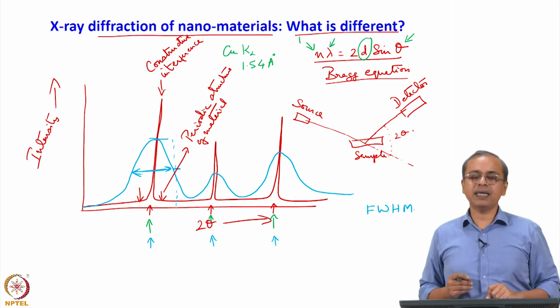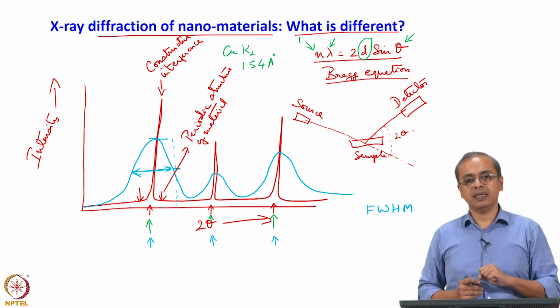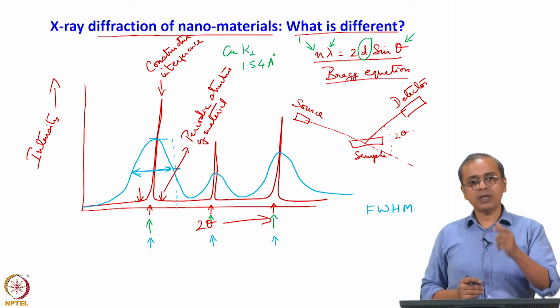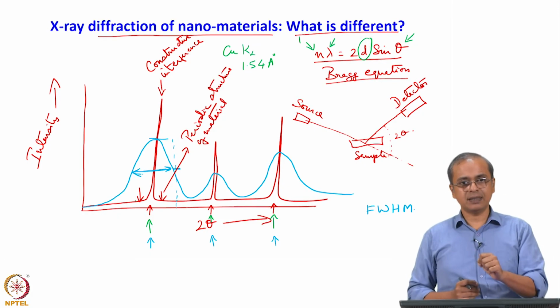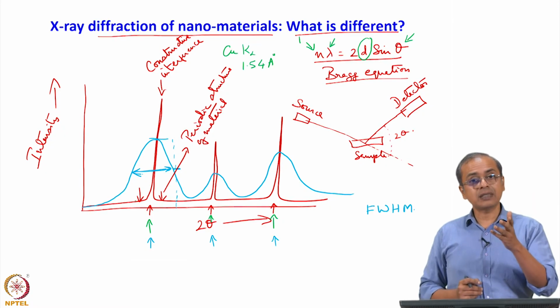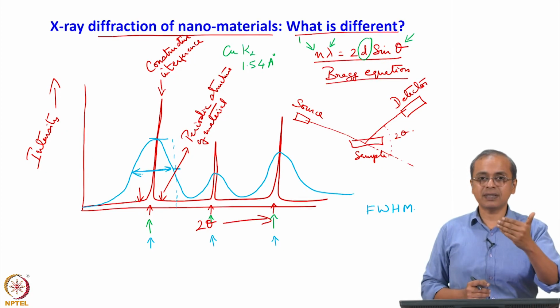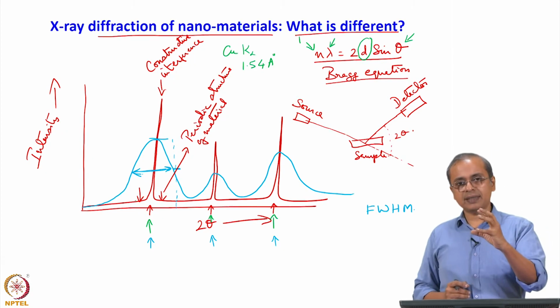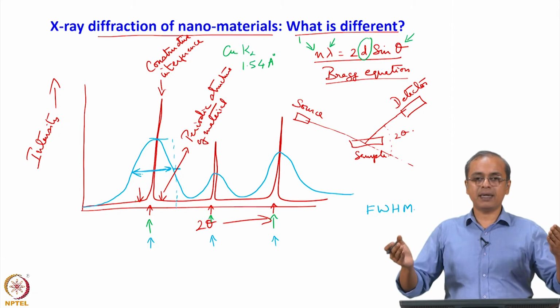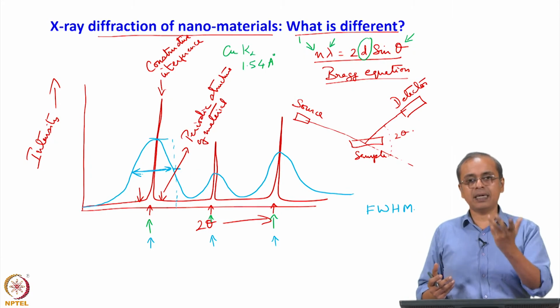So you have to go 50 planes down before you find that, but supposing the crystal size is less than 50 planes, it means in that sample the 50th plane does not exist. Therefore that half a wavelength out of phase at 1% away from the correct path length does not happen, and so destructive interference does not happen. So the smaller you get in size, the less the destructive interference that occurs when you go away from the Bragg angle, because those planes are not there in that sample. You have removed those planes, you have kept the number of planes less.